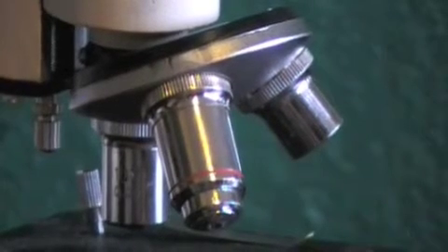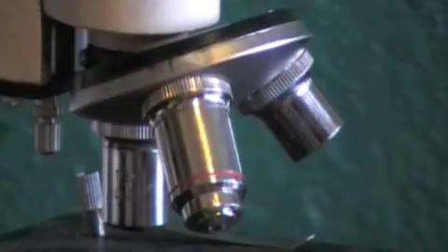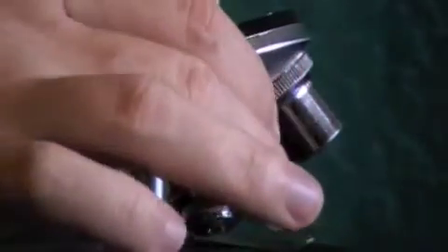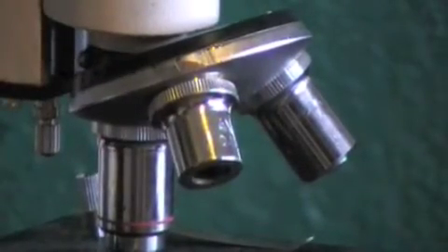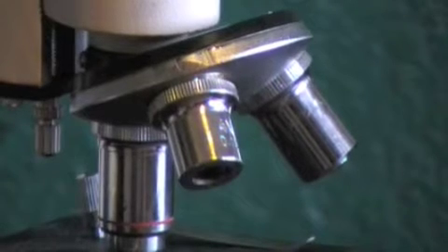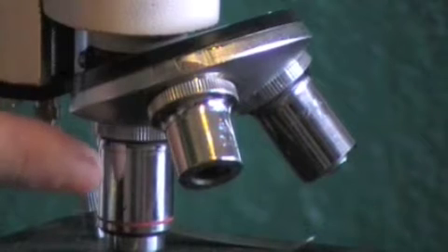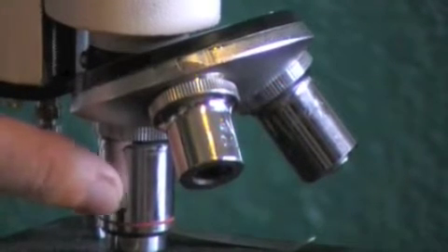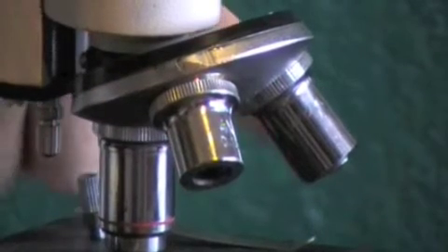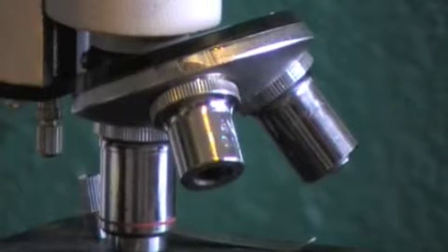However, if you want to get even closer to it, then you go to your high power objective lens. Your high power objective lens is 40 times the magnification. So, for the total magnification, you multiply your ocular lens times your objective lens. So a 10x here and a 40x here means this one is running 400 magnification. In the case of your low power lens, it's a 10x lens and a 10x lens, so that would be 100 magnification.